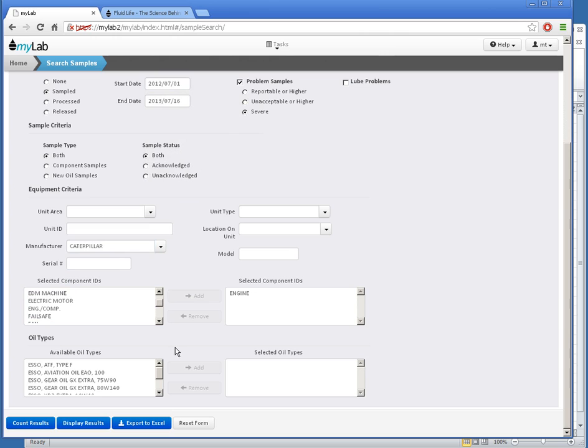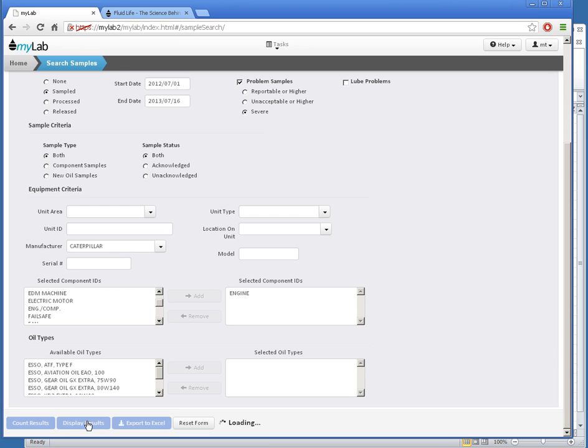Now that I've selected my criteria, I'll press Count Results here to see how many that is. My answer shows up here. Not too many. I'll click Display Results to get that list.